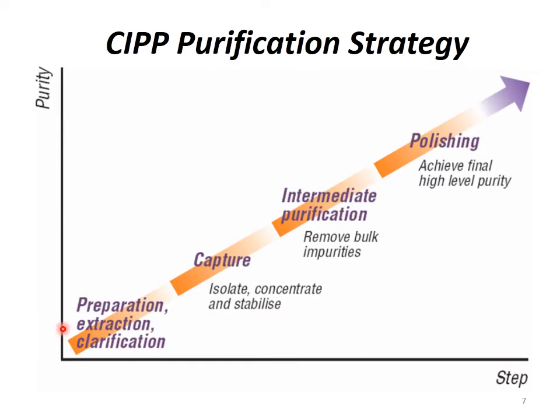and the proteins are extracted, and then this lysate is clarified. That is, we remove the insoluble materials from that lysate. Generally, separation is done by centrifugation. So the larger particles, unlysed cells, and debris are separated, and we get a clear lysate. This process is called clarification of the lysate. Now, this lysate is a mixture containing thousands of proteins which are obtained by cell lysis.